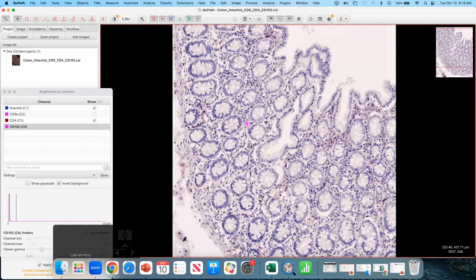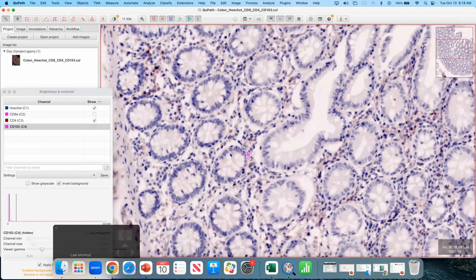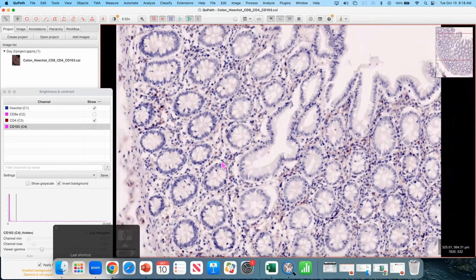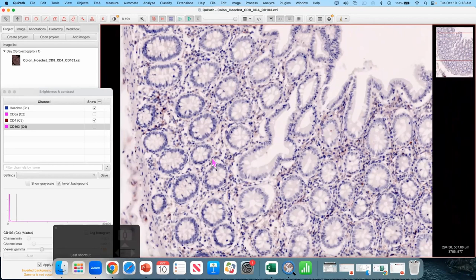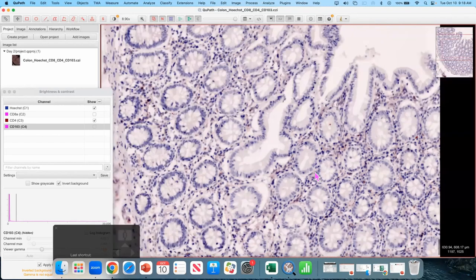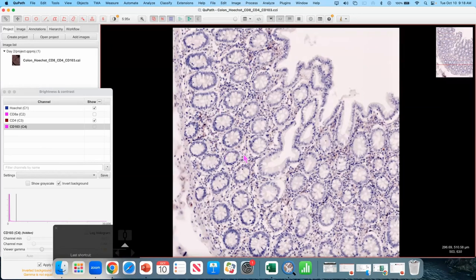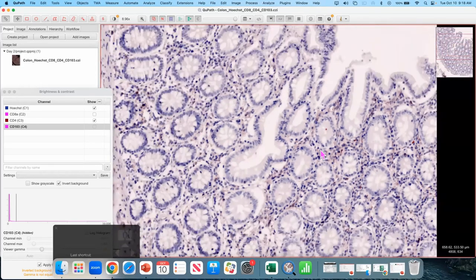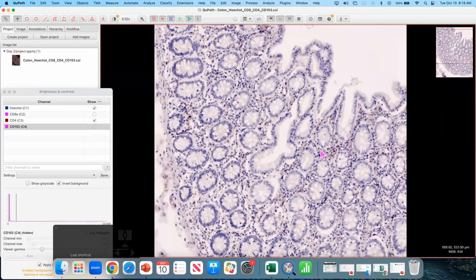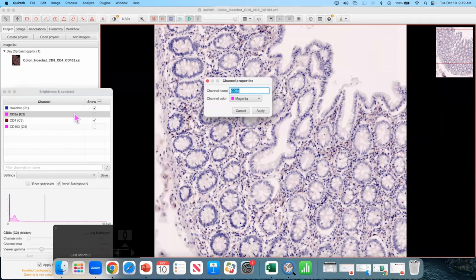So, I'm always careful when I'm working with research tissues, because you never know what mutant mouse you're working in. So, I've gotten in a lot of trouble before saying, like, oh, this one has a lot of lymphocytes. And they tell me, oh, this animal has no lymphocytes. But, long story short, so this lamina propria here, the kind of connected tissue in between the crypts, yes, there are immune cells there, and yes, they will be staining, as Sarah will show you. However, bear in mind what kind of environment the colon is. It's not exactly sort of the cleanest place in your body. And there is, there's a lot of immune cells there, sort of, constitutively, to make sure that you don't develop bacterial translocation and whatnot.